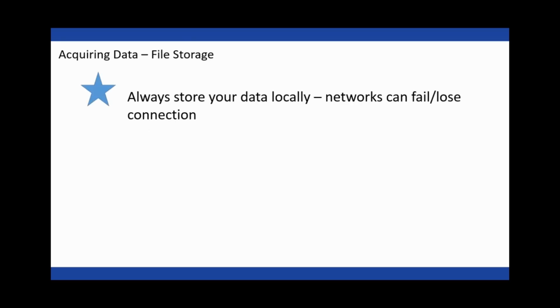And a couple quick points while we're talking about files are some file storage recommendations. So when possible, you should always be storing your data locally. And by that I mean storing to the hard drive that's in the computer that you're using to acquire your data. If you store your data to a network location, such as a remote file share that multiple computers can access in your lab, or if you're storing data to a flash drive or an external hard drive that's attached via USB to the computer, those sort of connections are more likely to fail than if you're storing the data directly to the hard drive.